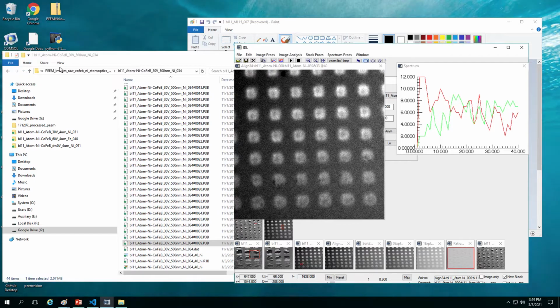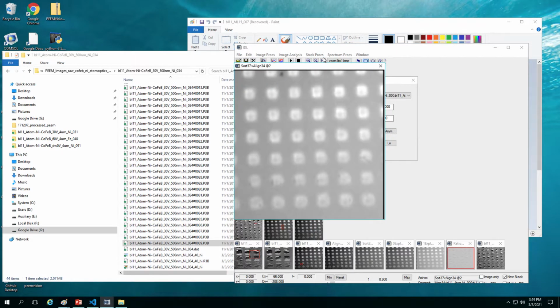Two and 20. See, if we do the alignment slightly differently by picking a different, actually this is a good dust to pick next time, and then you will get like sort of different results.